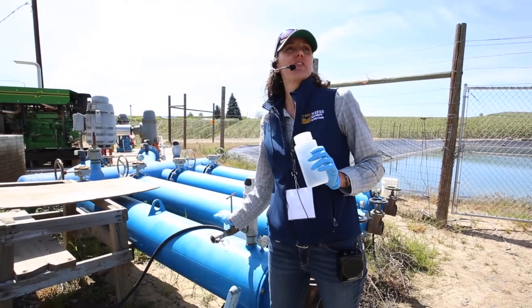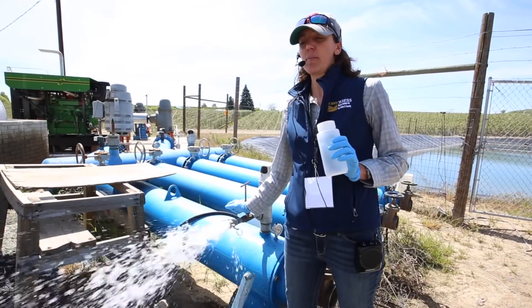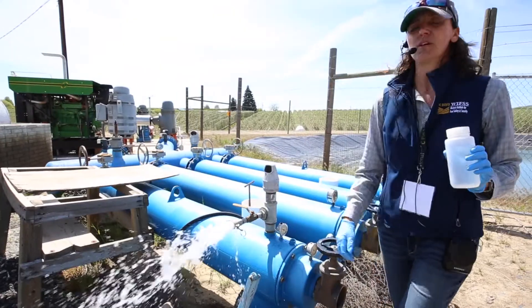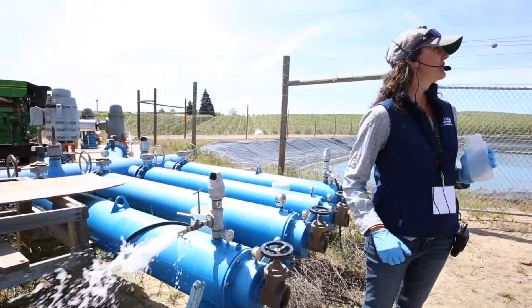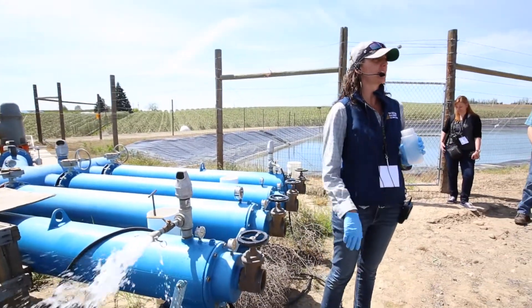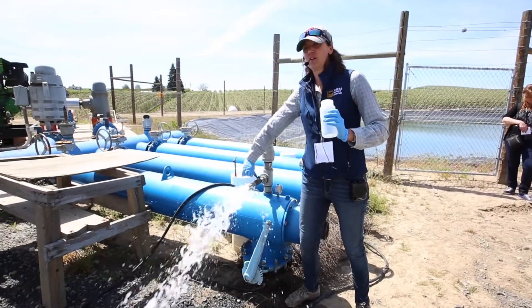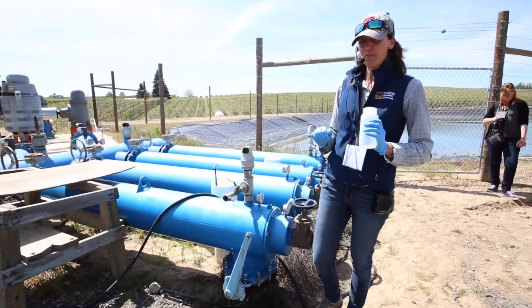I'm going to open this up and allow it to flush for a couple of minutes. In the interest of time, two to five minutes takes about 10 seconds here. Two to five minutes have passed — I've allowed it to flush. I've turned off my water.